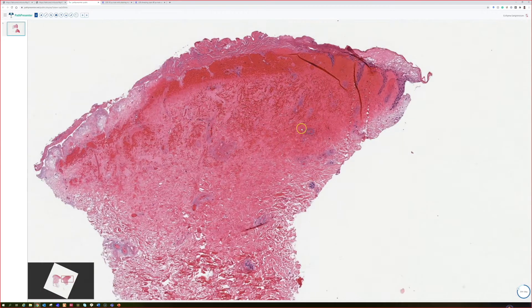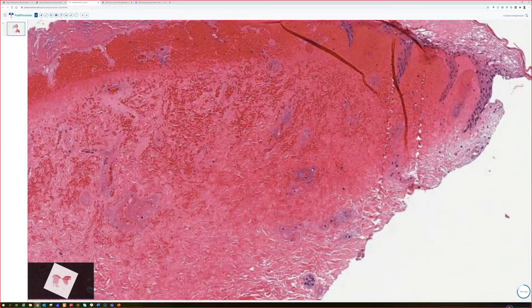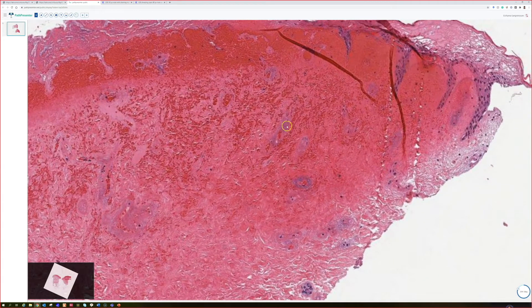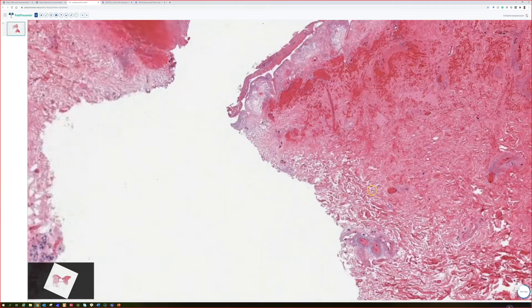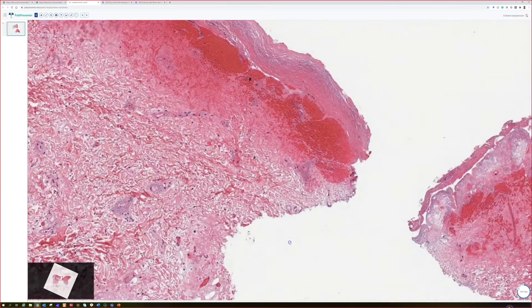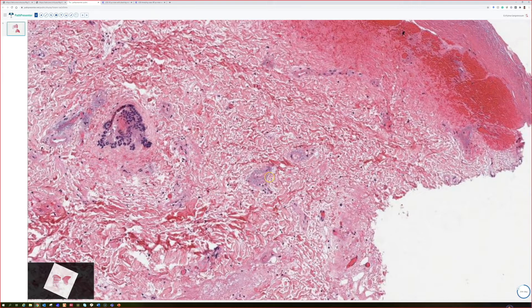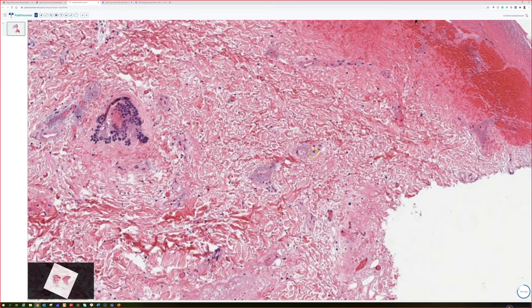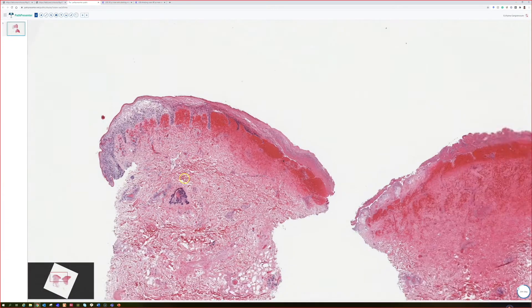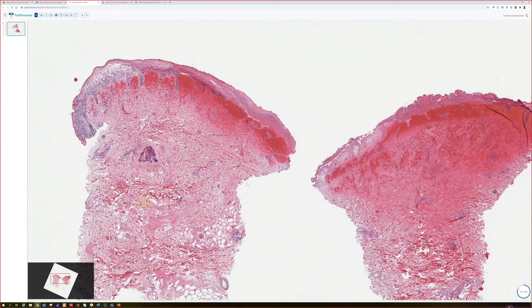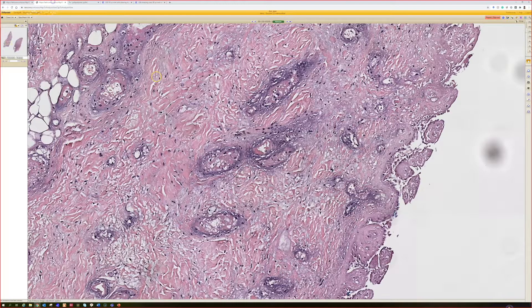Looking at the vessels — exactly like what we're seeing in our case, that blue haze. The finding you really want to look for is that bluish hazy material around the vessels with the necrosis, and of course the proper clinical setting. Ecthyma gangrenosum from Pseudomonas aeruginosa — good work.